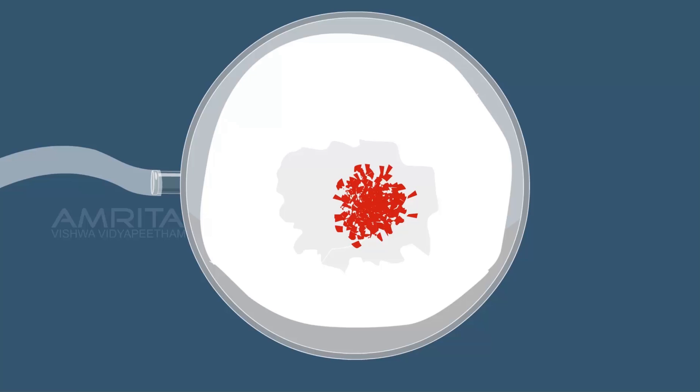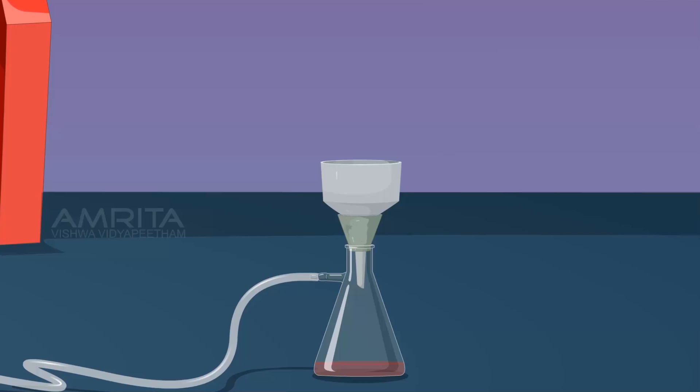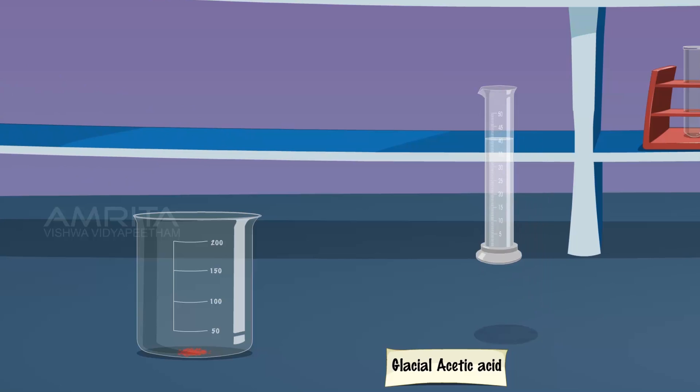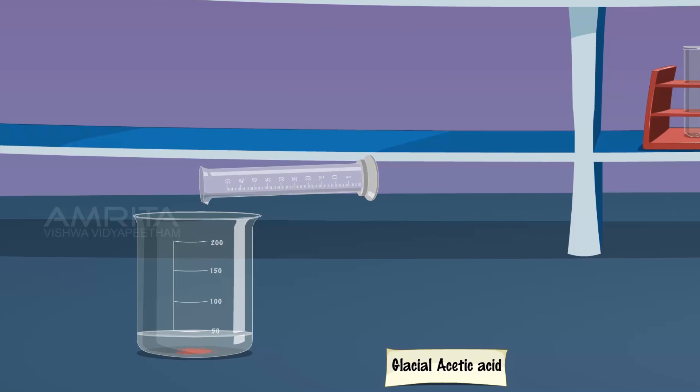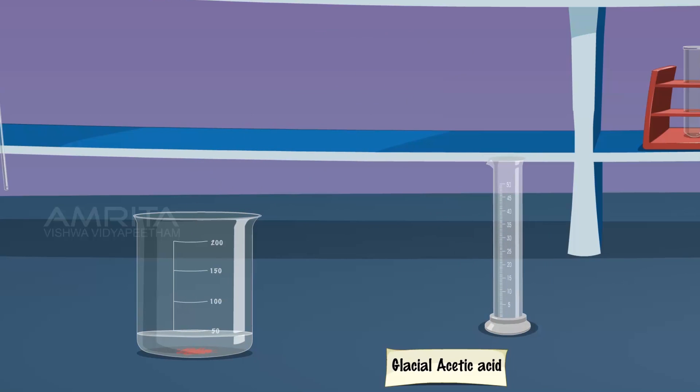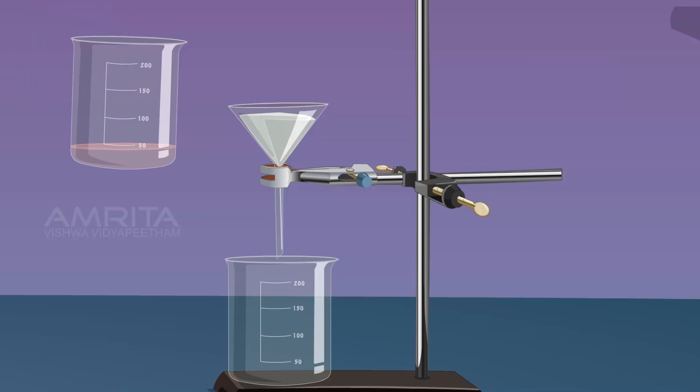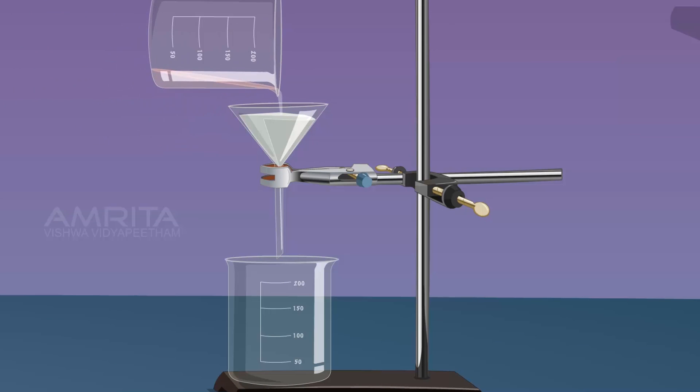Precipitate of 2-naphthol aniline dye separates out. Take the precipitate using a spatula. Transfer the precipitate into a beaker and add 40 ml of glacial acetic acid into it. Stir the contents of the beaker using a glass rod, then warm the liquid to get a clear solution. Filter the hot solution into another beaker.